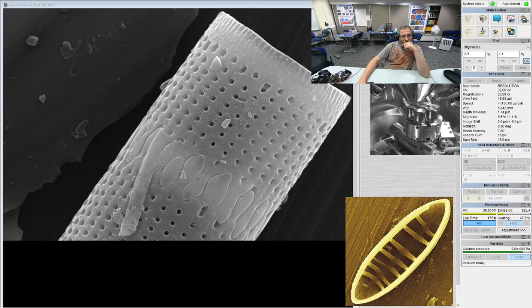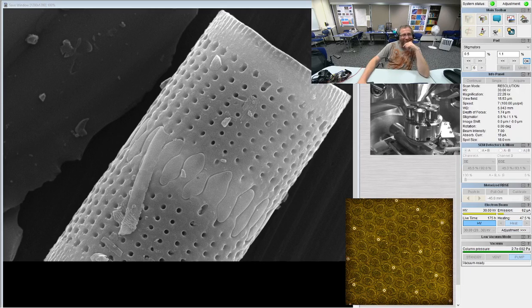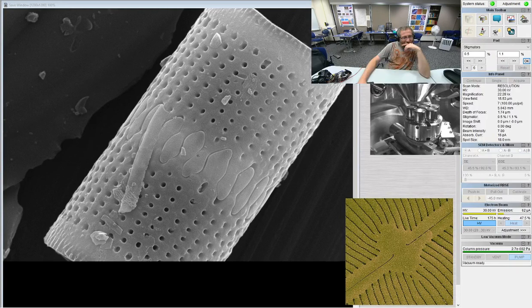Huh. What are you hawing? Oh, they're just really globular spines. They're not so regular. Okay. I was looking at the same thing. That's why when you went, huh, I was like, huh. Yeah, they're just lazily put together. There's really not a good policy on how to make a spine in this diatom.